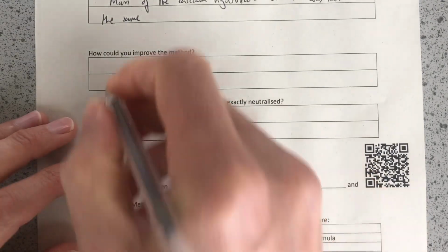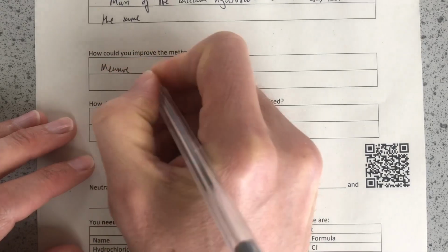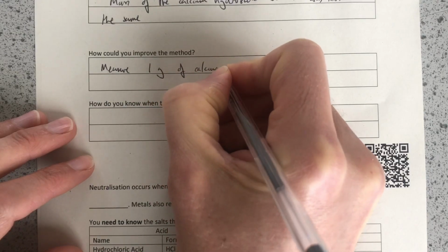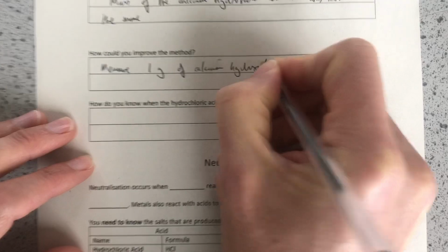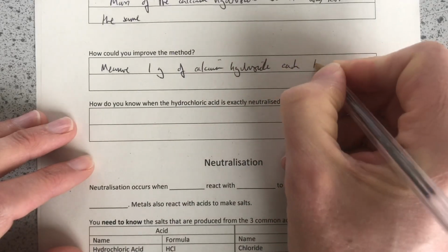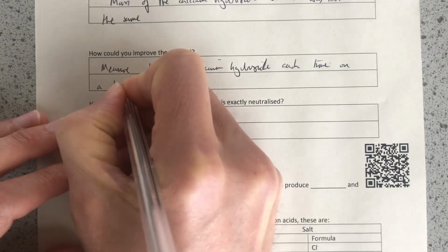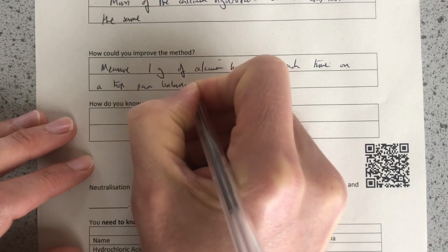How could we improve the method? We could measure 1 gram of calcium hydroxide each time on a top pan balance.